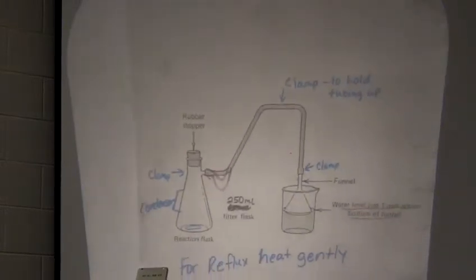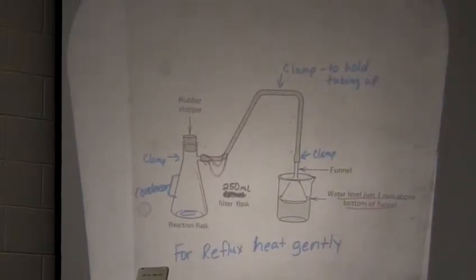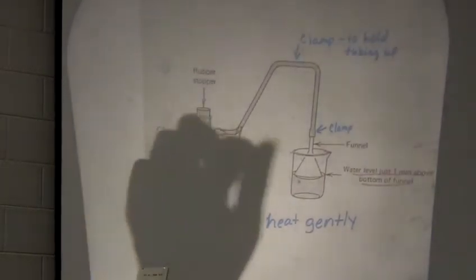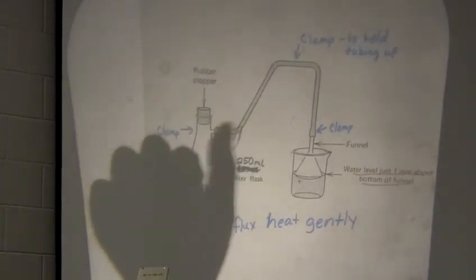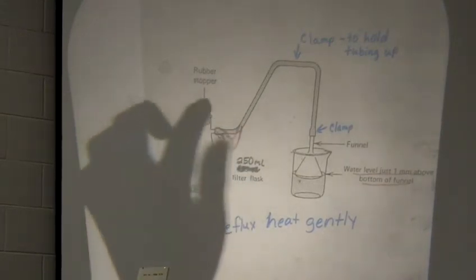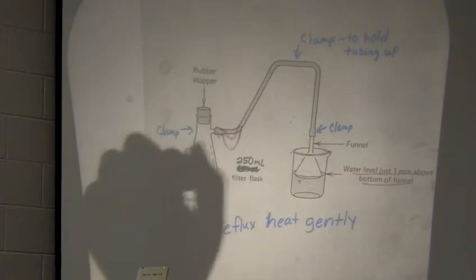For this reaction, what gas did I say was generated from the reaction? HCl is generated, okay? We have to account for that in what we set up because of the HCl that's generated, all right? So you each are going to be doing your reactions in a filtering flask, okay? So not a round bottom flask, but a filtering flask, all right?